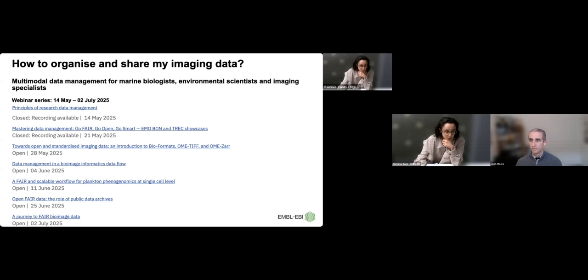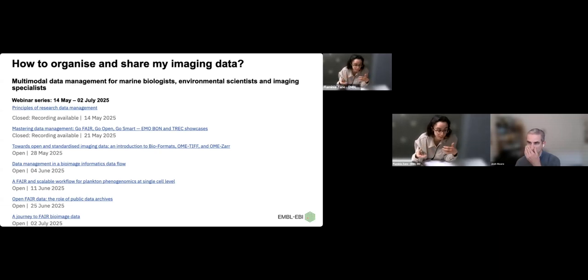Okay, so we then have another question about related. So how fast is the conversion? It's the same person asking different questions, so I'm going to ask them all at once. How fast is the conversion? And do you have experience on file size of raw versus OME-Zarr file format? And if there is someone that is in charge of maintaining the conversion in the sense of adapting it, if there are modifications from companies?